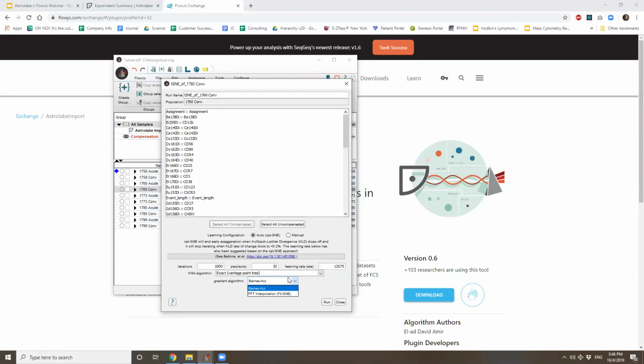Cool, and I have to admit that tSNE has run blazingly fast for me when using FlowJo. I'm just using a standard desktop computer, and running these over 1 million cells took about 15 minutes. And speaking to you, that seems to be a pretty common experience.